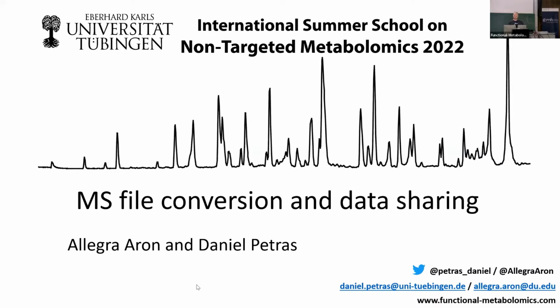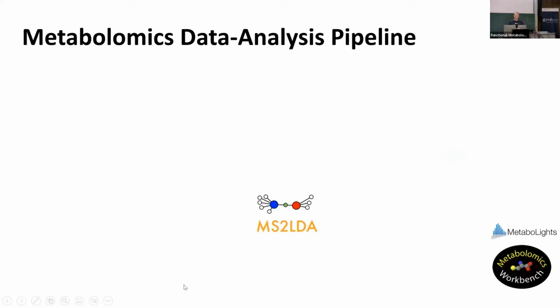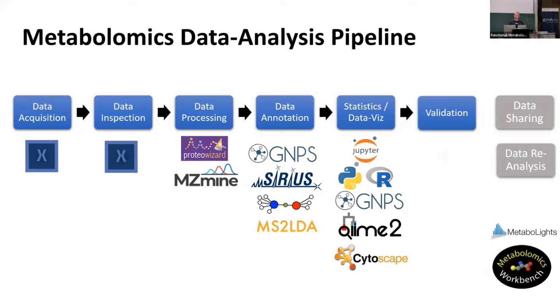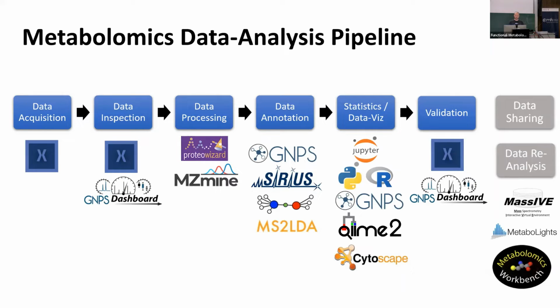All right, so to get started, let's take a look at the things that we're planning to do with you this week. This is the metabolomics data analysis pipeline that some of us use. Again, there might be many other tools and many other ways to do things, but this is roughly what we have in mind for this week.